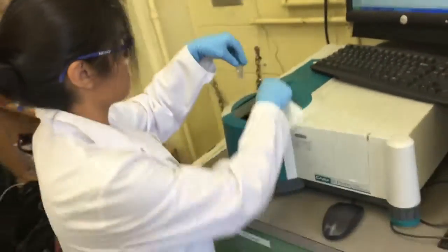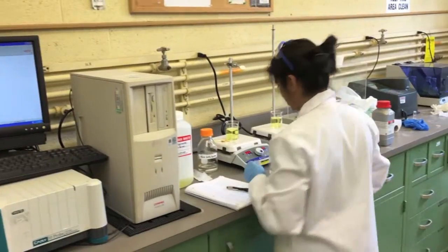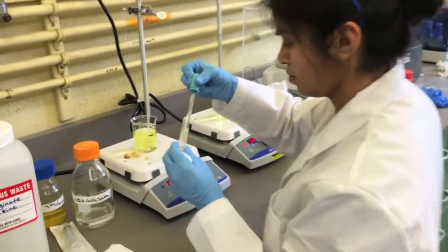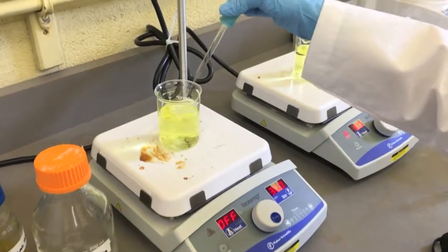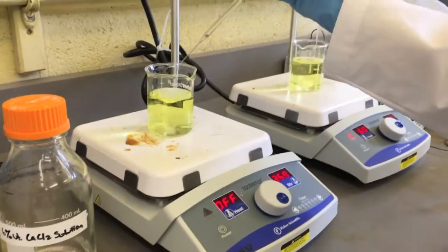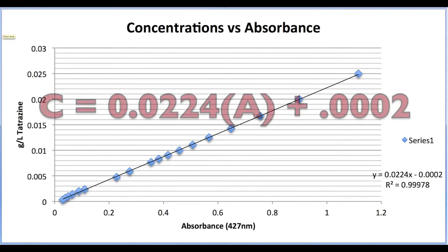In this experiment, we were using a spectrophotometer to measure absorbance. We must make a calibration curve in order to correlate this into concentration of tartrazine in the solution. We mixed tartrazine solutions to several different known concentrations and measured the absorbance. We used Excel to graph this data and get our linear correlation curve.